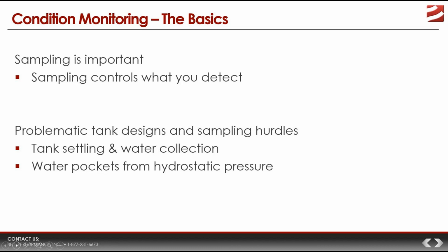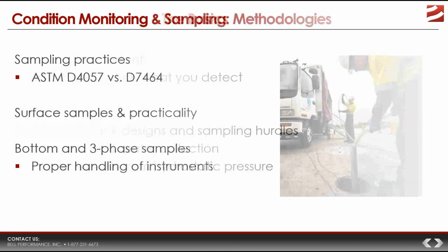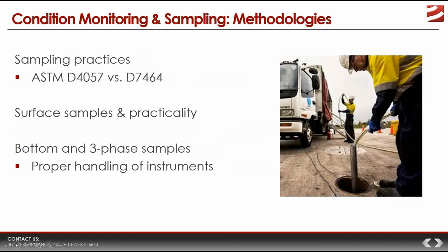Now, how do you know this? How do you know if those have deformed? You really don't. So these are examples of how much variance there can be between what's appearing in our sample and what's actually going on in reality in the storage tank. Now, if it's true for something as simple as water in the tank, it's just as easily true for microbes as well. And without a good sample, it is impossible to know if your microbial test results reflect the reality of the situation in your storage tank.